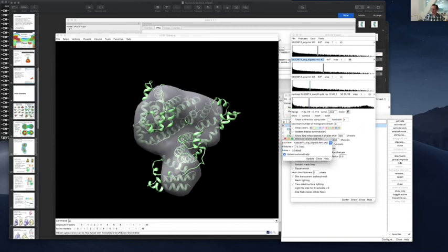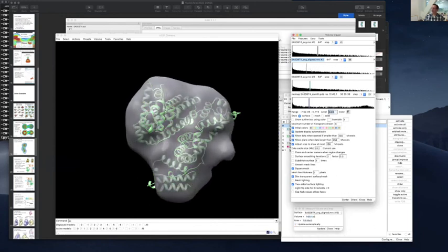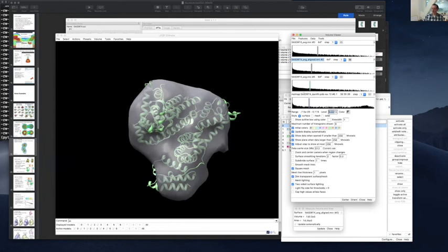And you can see the volume is 73,000 angstroms cubed. And as I raise and lower my threshold, it changes the volume interactively, which is really nice. So say if I look at this and the volume from the Porod volume is supposed to be, you know, 120,000, then I can move this threshold until I get to 120,000.